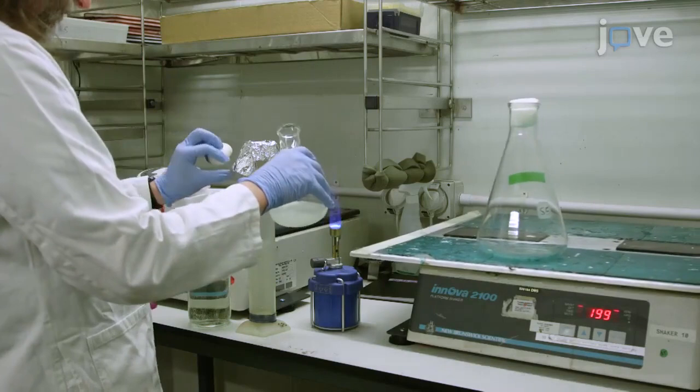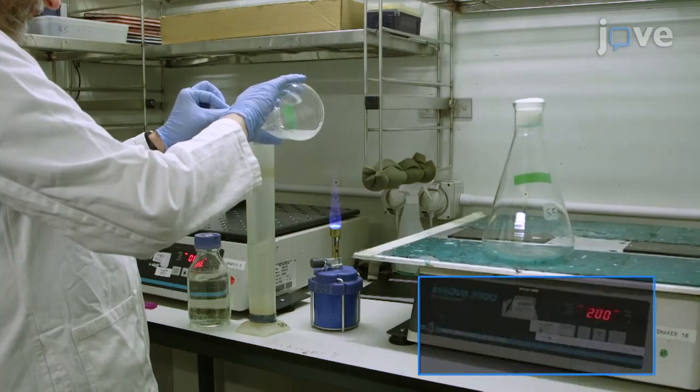To begin this procedure, grow yeast in YMM medium to an OD600 between 0.6 and 0.8.